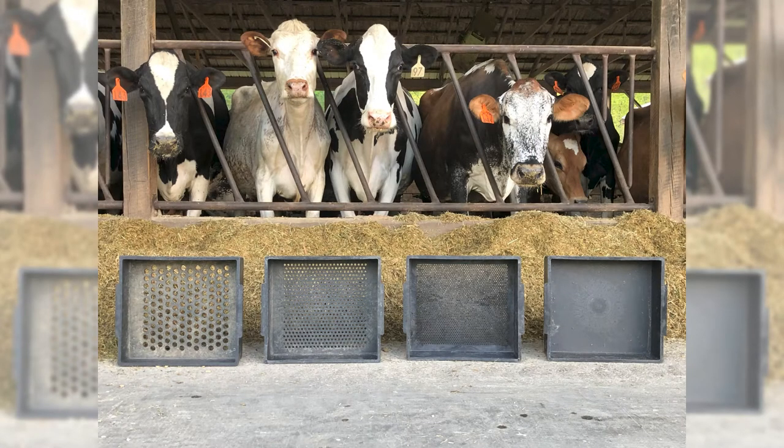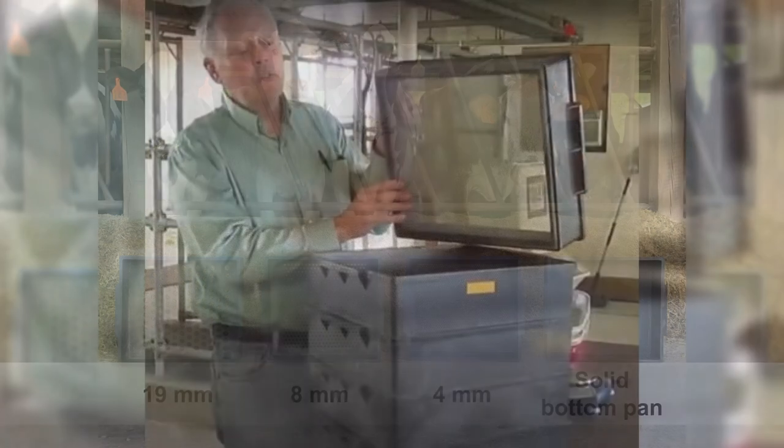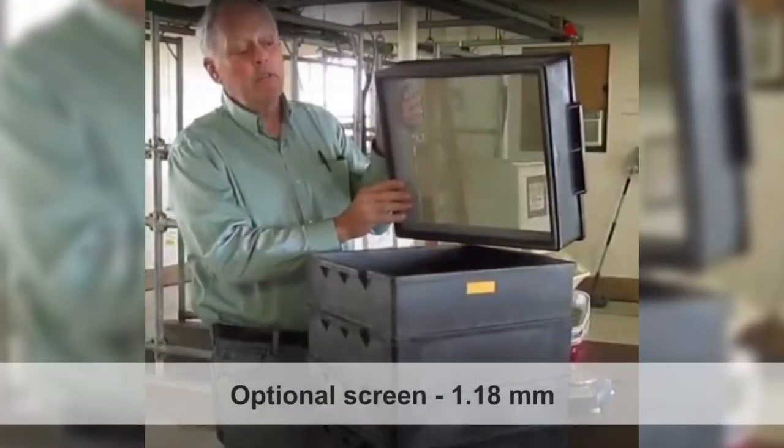The PSPS separator consists of screens containing holes that measure 19 millimeters, 8 millimeters, 4 millimeters, and a solid bottom pan for collecting fine particle sizes. There is an optional 1.18 millimeter screen available with the PSPS separator. While it is generally not used for forage analysis, it is a valuable tool to measure grain particle size.